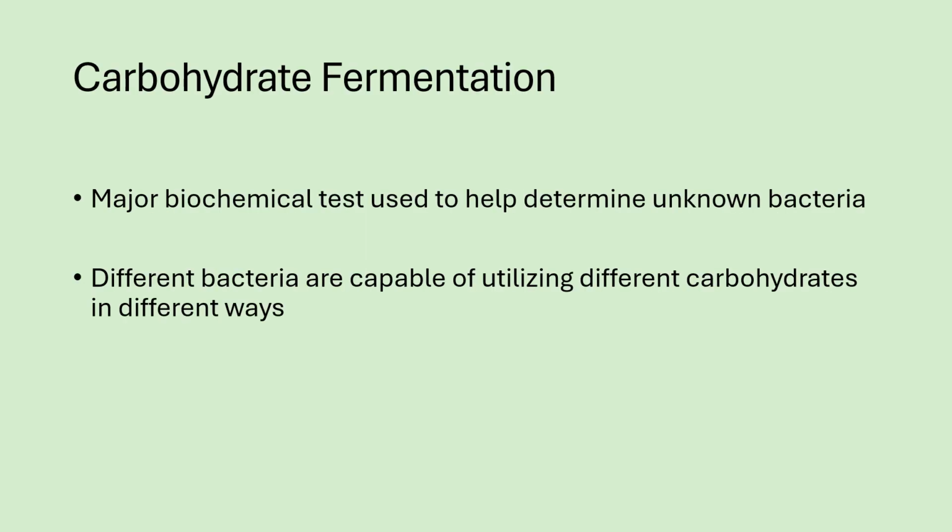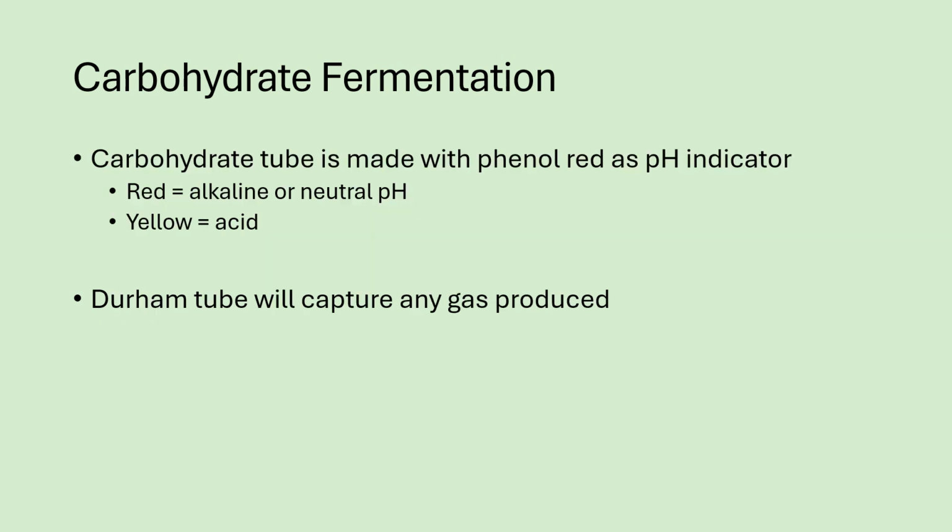It's actually one of the major biochemical tests that will help you figure out what organism you have. Different bacteria can utilize different carbohydrates, which are sugars, and how they use the sugars is also different as well. So that's why this is a very important test to do.